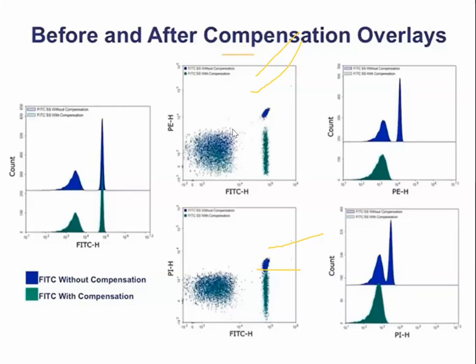Okay, similarly in dot plot, this is a histogram. Okay, when you have numbers on the y-axis, it's called a histogram. When you have two fluorescent markers on x and y-axis, it's called dot plots. Okay, this all I'll cover in data analysis.